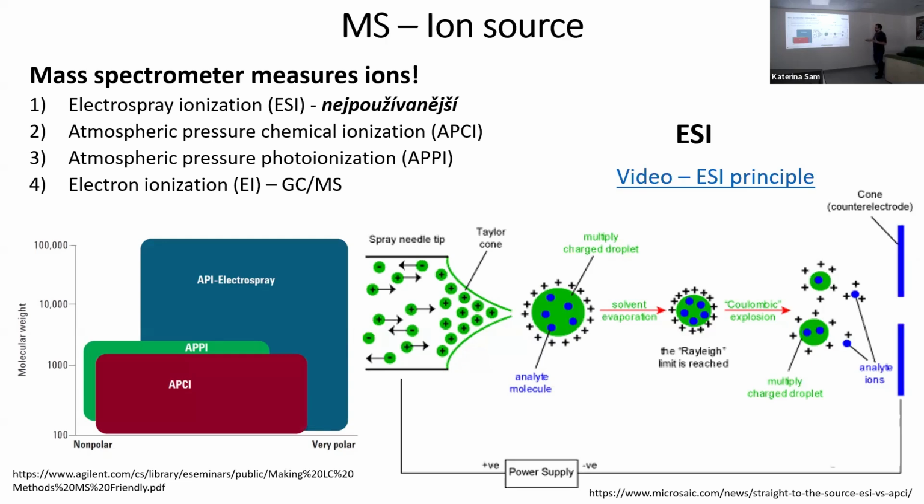But all this space is under high temperature, typically 350 degrees Celsius, and we evaporate the solvents, and the space charge gets bigger and bigger, and after that comes the Coulombic explosion, that's its special name. We prepare the analytes with the charge, and they are the ions. Typically, for small molecules, we have charge 1.